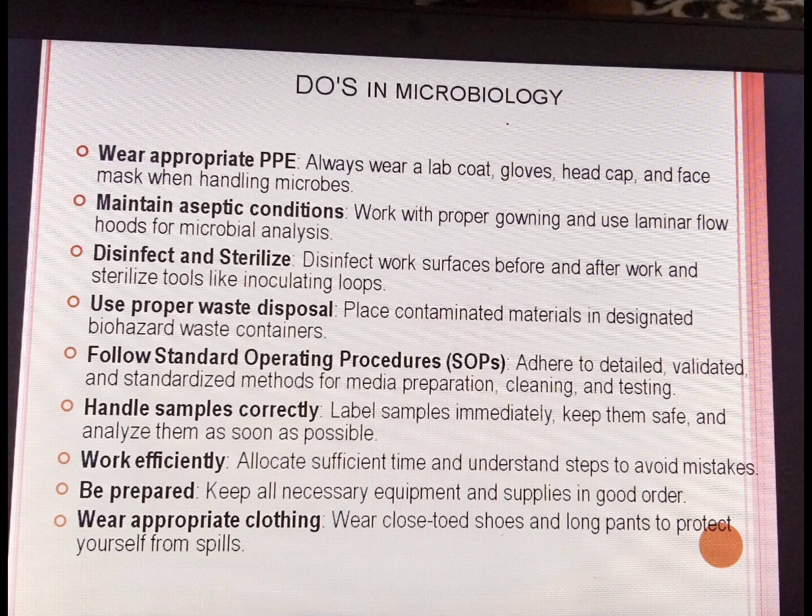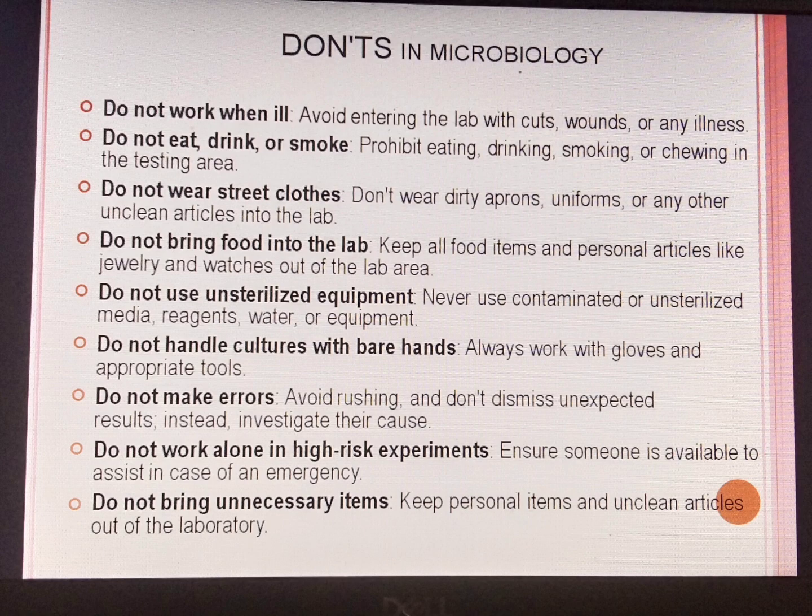Work efficiently. Allocate sufficient time and understand steps to avoid mistakes. Be prepared. Keep all necessary equipment and supplies in good order. Wear appropriate clothing. Wear closed toed shoes and long pants to protect yourself from spills.